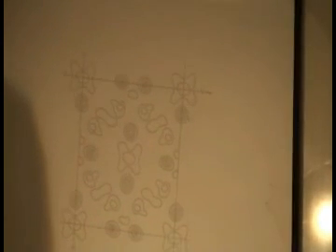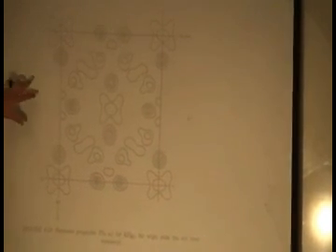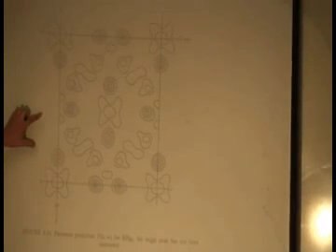Well, now it's actually time to look at our Patterson maps. Here are two of your maps, okay? This is a UW map. We just figured out there should be a peak at what? 1/2, 0, 0, right? And this is a projection.